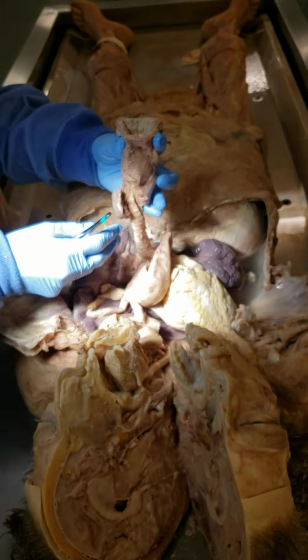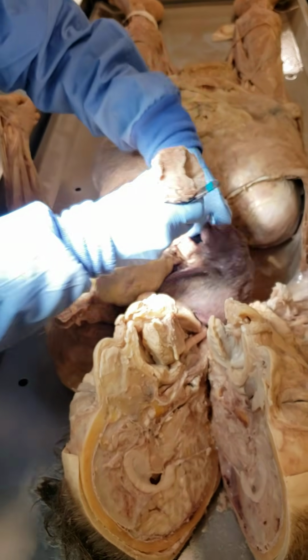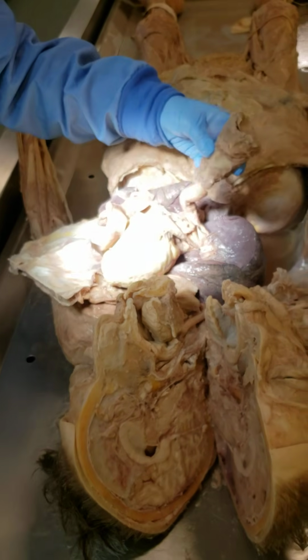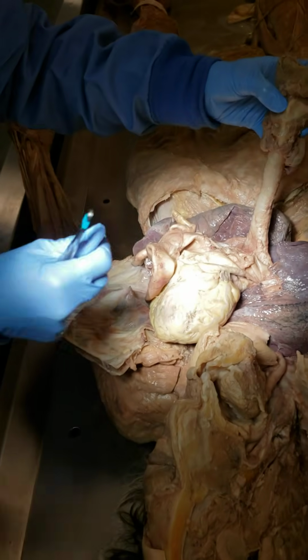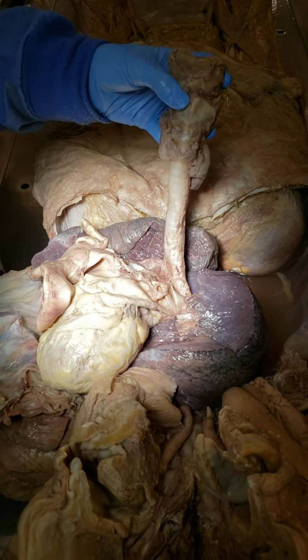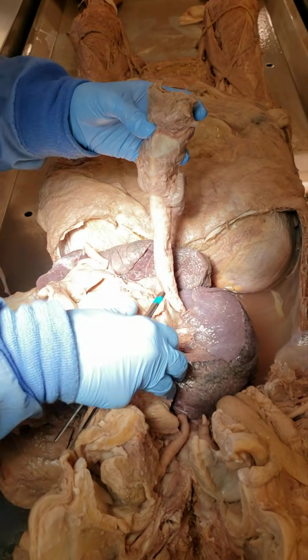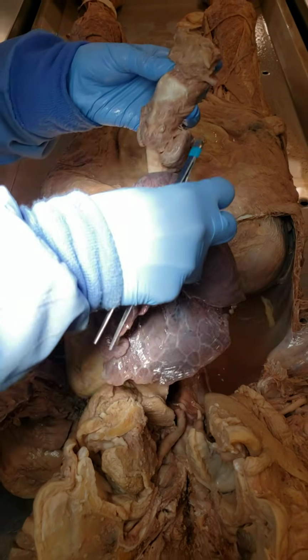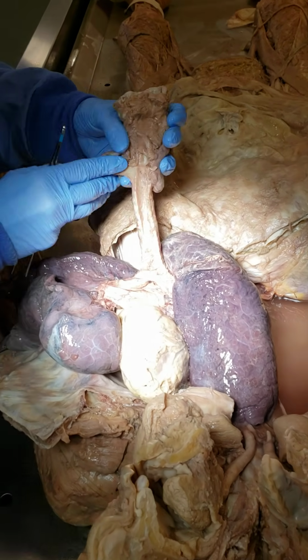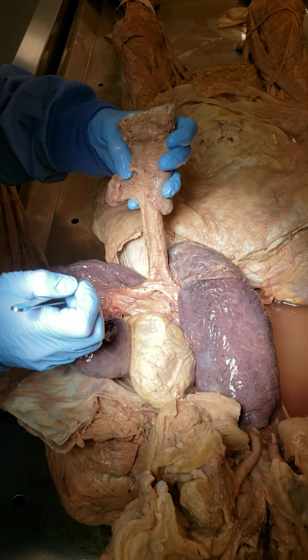on Jenny. So, if I can just put some light over here. All right, so you can see that the trachea has these C-ringed cartilages, right? And again, I'm going to go to the posterior aspect, and what's really neat is, look at this. You can observe the trachealis muscle.